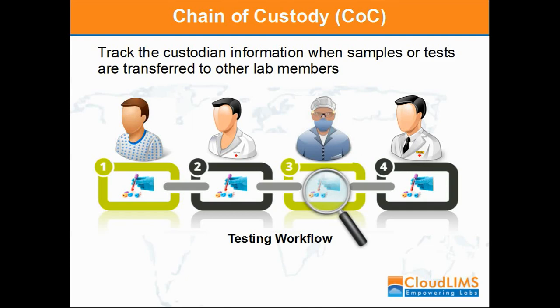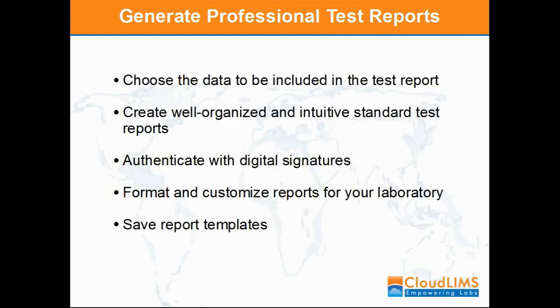The extent of automation and data reliability can vary. Also, FDA and EPA compliant electronic signatures and system security are rare. More often than not, it's not the incorrect testing procedure or a wrong sample that ends up in a wrong report. The standard reporting format must be implemented for accurate results reporting.